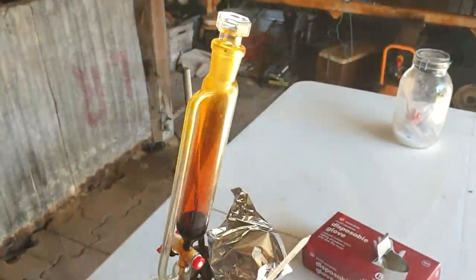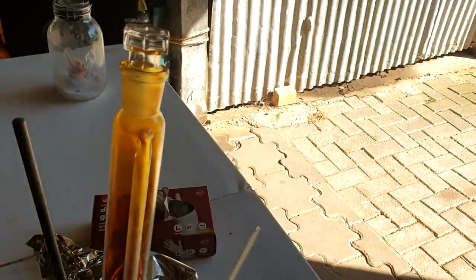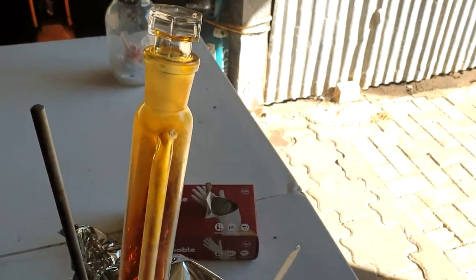Putting off a lot more gas than I thought it would, so it's venting a little bit. The drip rate's reasonably slow. Oh, it's not that slow, but yeah, you see it. Here we have clouds of bloody, I assume, hydrobromic acid fumes. Not the healthiest.